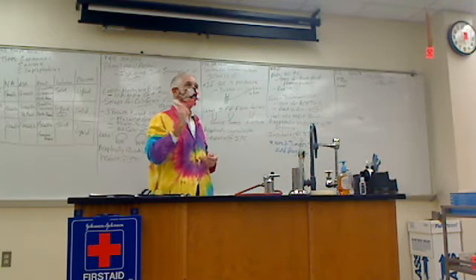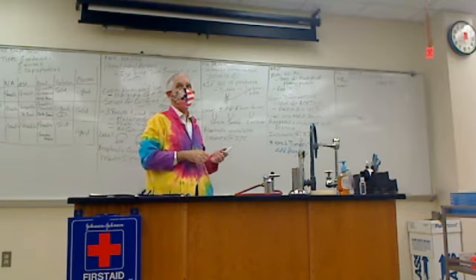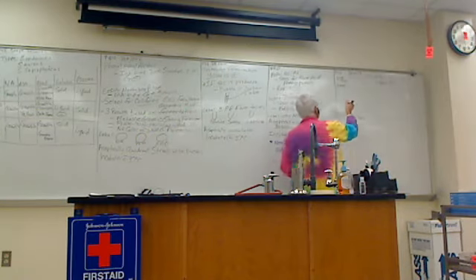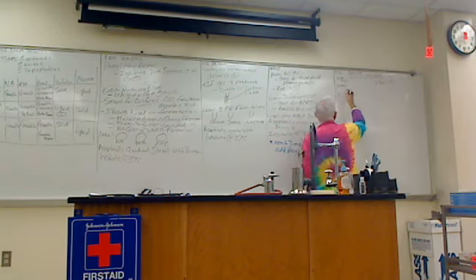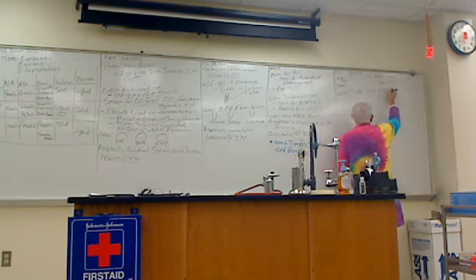Look at the picture atlas. It's got all of these results. You're going to need those for your unknown. All right, guys? Now, you're going to label your tube. And use the needle.